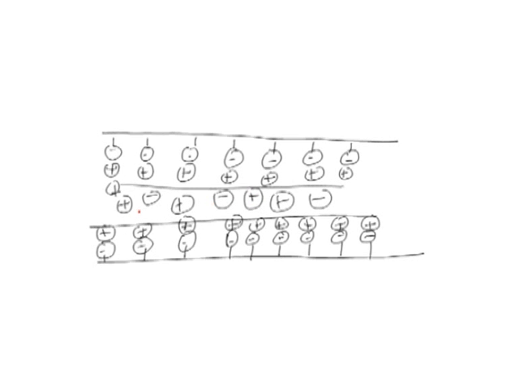The negatively charged ones will be aligning here, and when the voltage is applied, these positively charged ions will move towards the cathode, or negatively charged electrode. So, those attached to the wall, when the voltage is applied, all move towards the cathode.